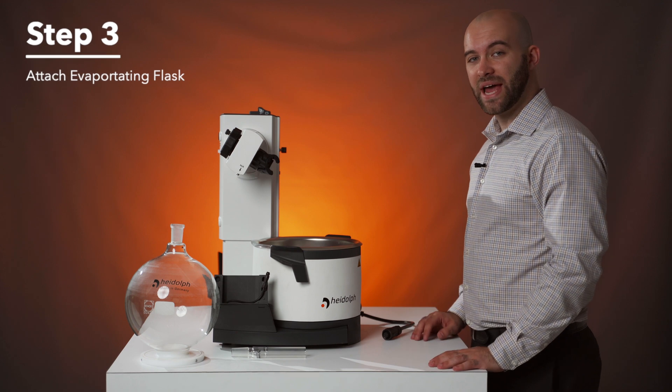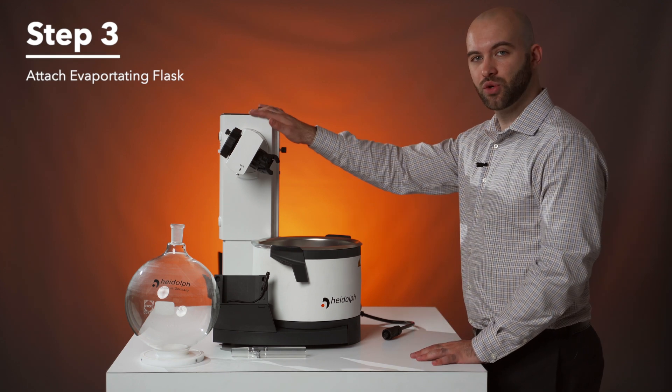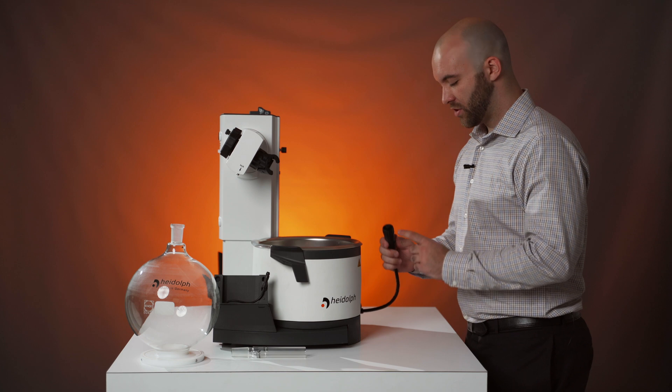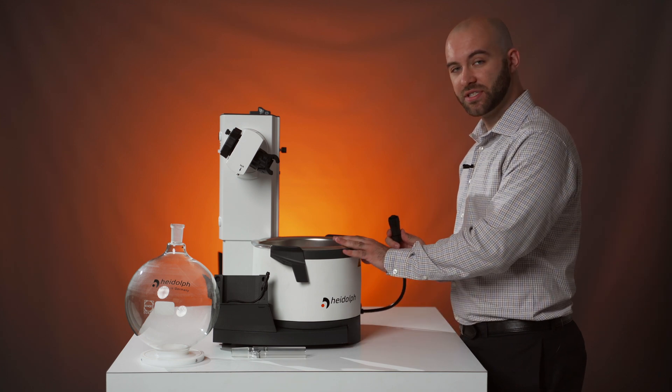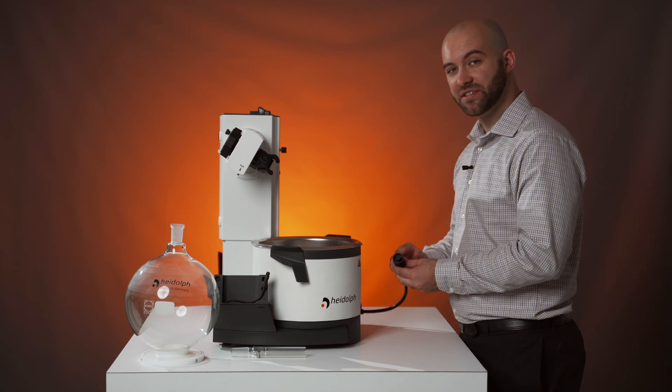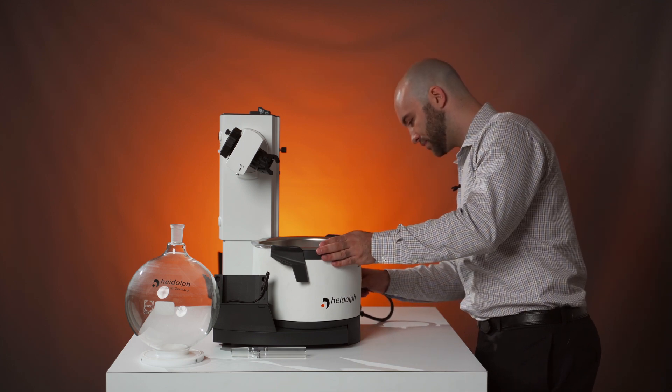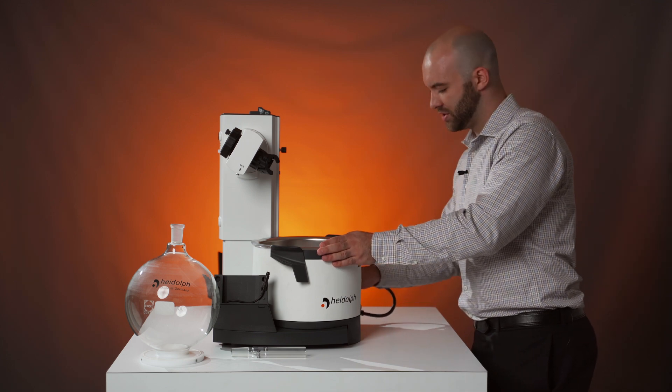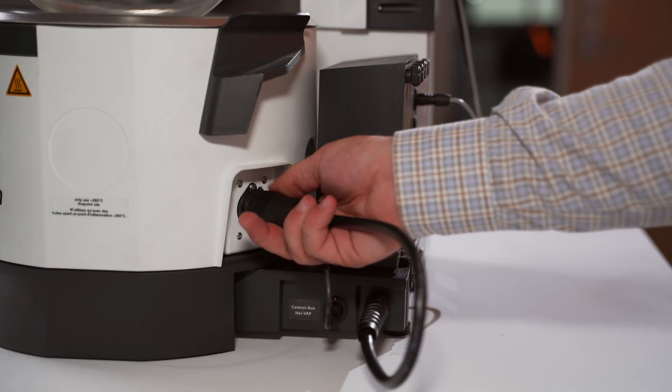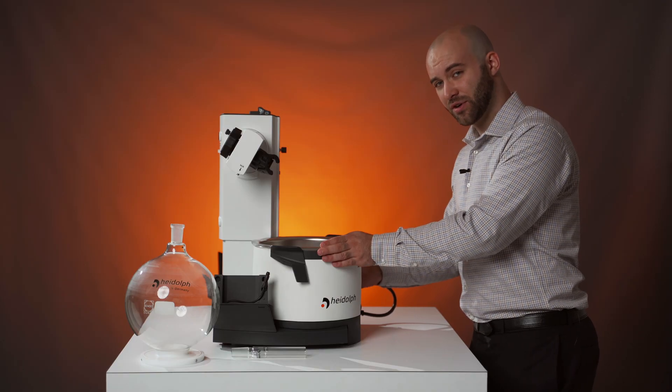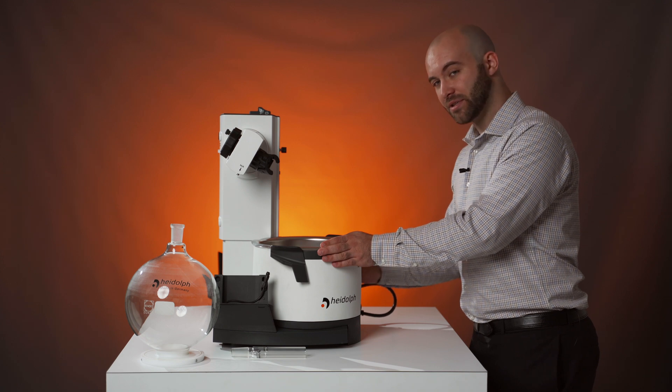Step three, we're going to add the evaporation flask to our HiVap. While we're here though, we're going to first attach the HiVap itself to the heating bath using this IP67 screwing cable. It slots right in the back here, lines with notches, and can be screwed on fairly easily. That is so at any time you can remove the bath for filling and emptying.